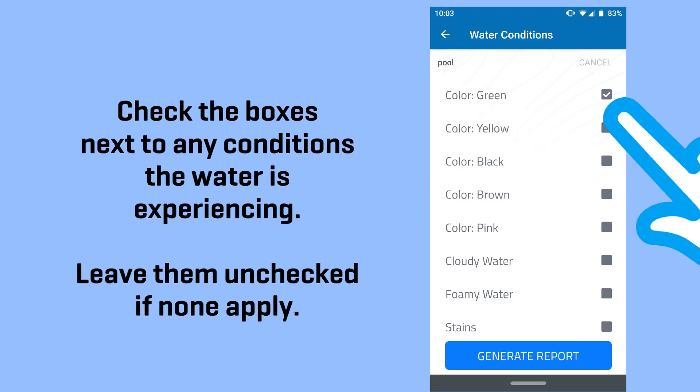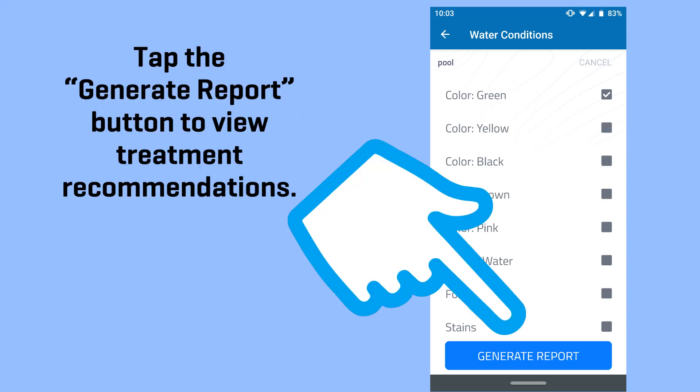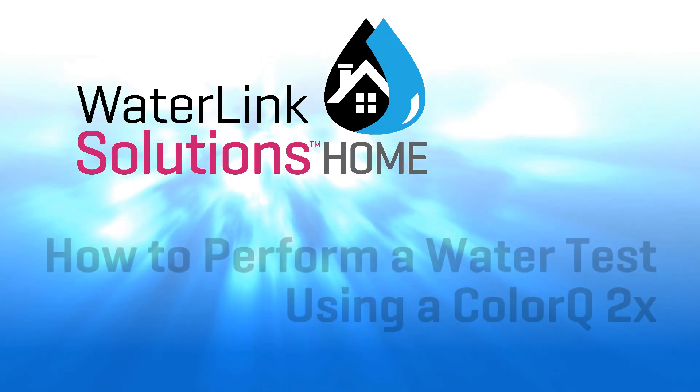Check the boxes next to any conditions the water is experiencing. Leave them unchecked if none apply. Tap the Generate Report button to view treatment recommendations. Make sure to record the proper instructions.